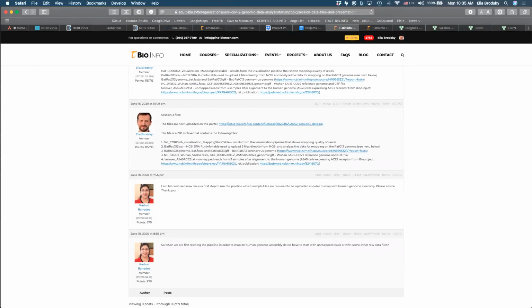All right, excellent. So hopefully this explains to everyone how to navigate the different resources and files and projects to be able to replicate the analysis from your own computer on your own account. Again, please do this in the context of the sessions that we do and in the context of the assignments. Okay, and again, Wesley is asking, how do you assemble or make the CSV files for NCBI upload?